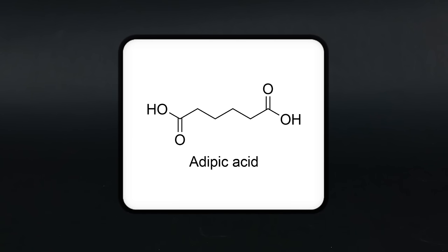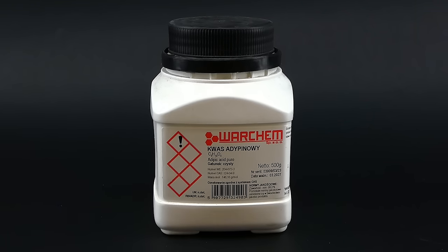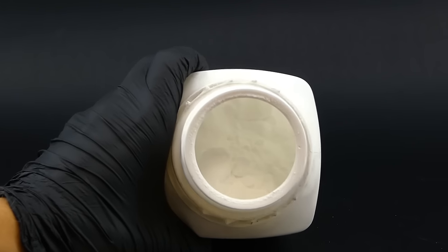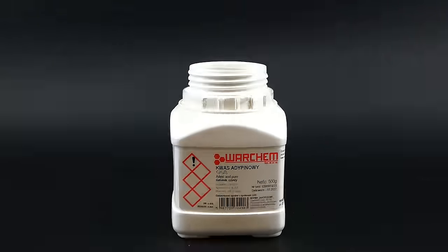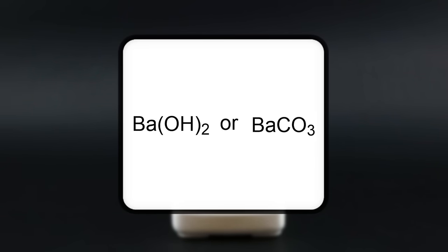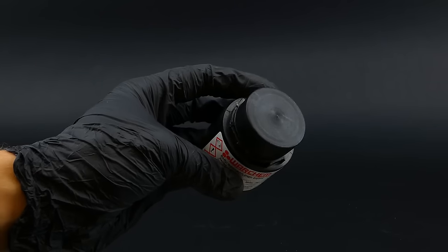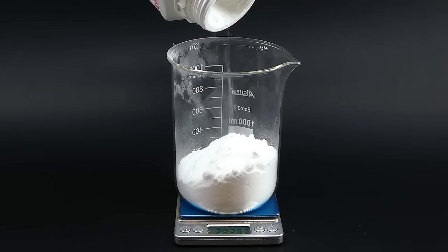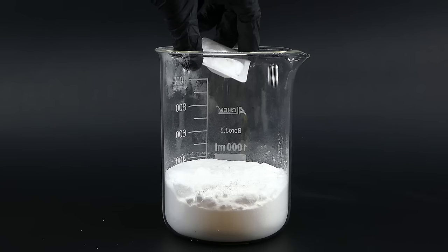To make this cyclopentanone, I need a chemical called adipic acid, which is just a longer version of oxalic acid and is actually used as a food preservative, so I was able to get half a kilo of it from a chemical supplier for pretty cheap. It looks like a white powder, and to turn it into cyclopentanone I have to decarboxylate it using a catalyst — in this case some barium hydroxide — because it is one of these stubborn molecules that are too lazy to decarboxylate by themselves. In this chunky beaker I weighed out 250 grams of adipic acid and then added 9 grams of barium hydroxide octahydrate to it.